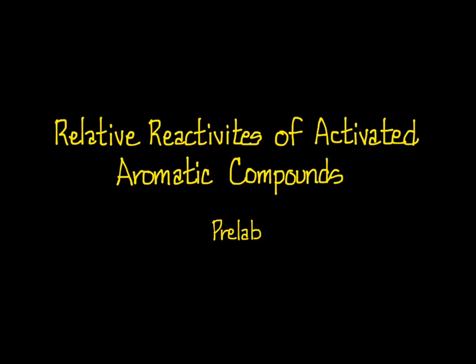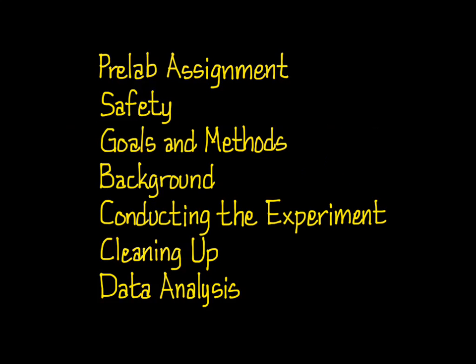This is the pre-lab for the experiment Relative Reactivities of Activated Aromatic Compounds. In this video, I will cover the pre-lab assignment, safety information, the goals of the experiment and the methods you'll use to achieve them, some background information, details on conducting the experimental procedures, important information about cleaning up, and some information about analyzing the class data.